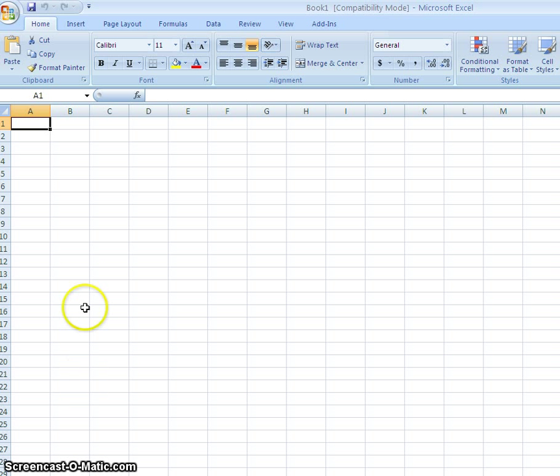So I'm going to try to give you a little bit of help with this first lab here. This is just the first part of the video. I'll try to make another video on some more of the calculations, but this is just trying to get the volume of your empty pycnometer. So one of the first things you looked at was the mass of the pycnometer.